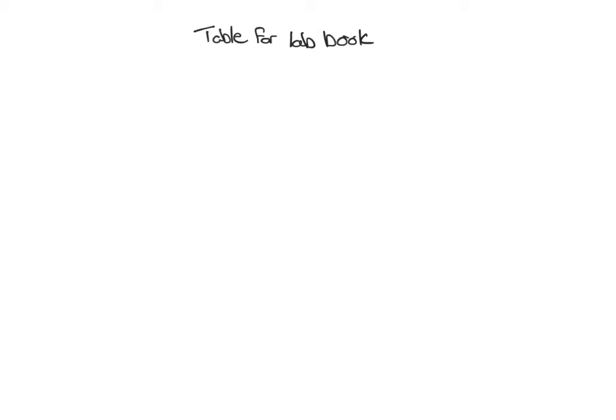So for the table in your lab book, this is going to have a proper table. I just put "table for lab book" here, but you need a proper title. The type of information you need in your table is going to be whatever your variable is, which will be one column. So plasmid, insert, strain, temperature, whatever that may be. You need to tell us the number of white colonies, the number of blue colonies, and what type of plate this was on with the concentration of antibiotic.